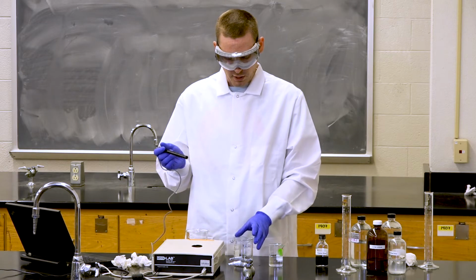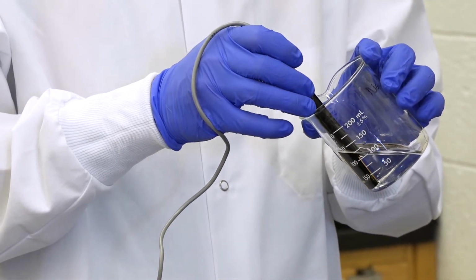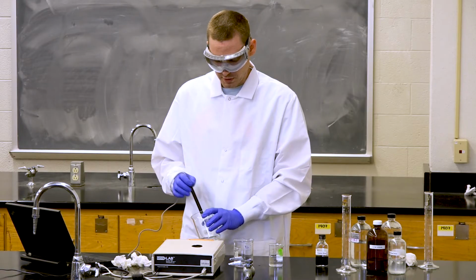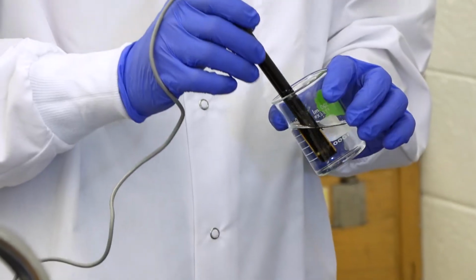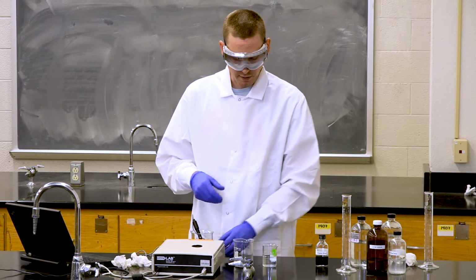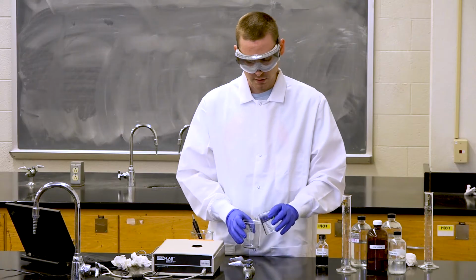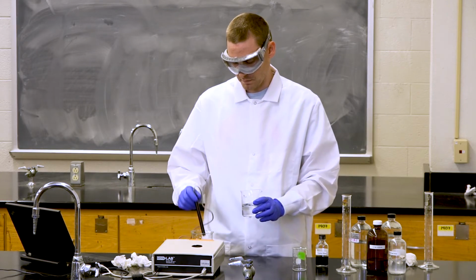Now we can again start measuring the conductivity of our solutions by placing the conductivity probe into solution and then observing the conductivity on the meter. After we measure the conductivity of our sodium hydroxide, we can rinse off our probe and then measure the conductivity of our hydrochloric acid. After we measure the conductivity of the hydrochloric acid, we can then mix these together by adding the sodium hydroxide to our hydrochloric acid. And then, after they have been mixed together, measure the conductivity one more time.